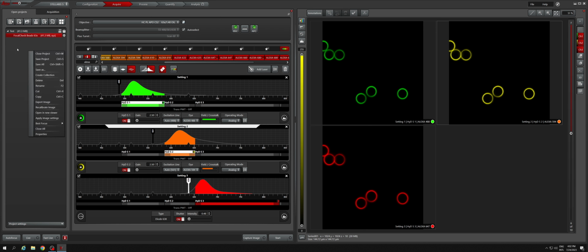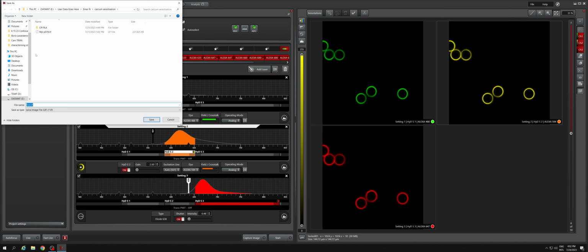Go, and then you just click anywhere on here to fix it. Sometimes I put in the objectives and whatever I used. And then once you've done that, you have to go to Save Project. So just right click and Save Project.